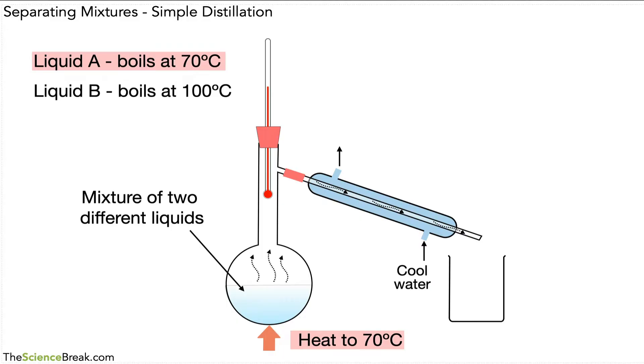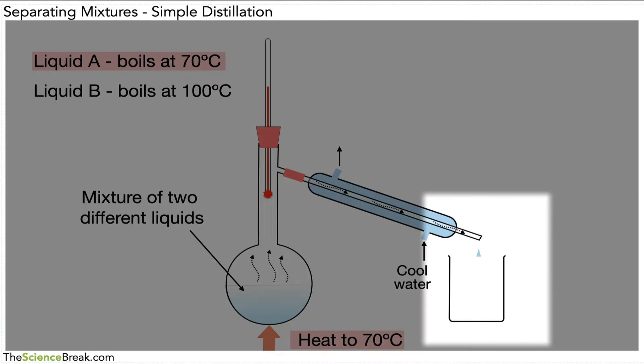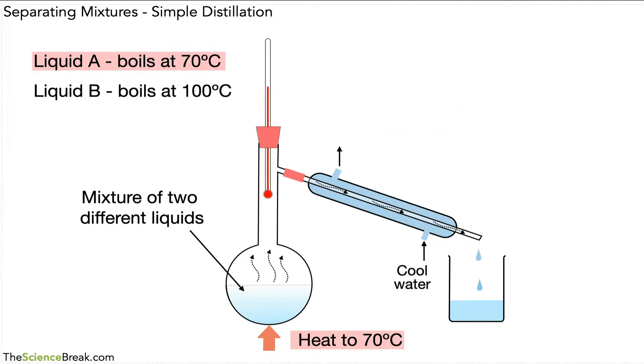If you look very closely at the beaker, you'll see that the vapor will condense and come out as a liquid. We can now collect the liquid at the end of that delivery tube. So this is how that works.